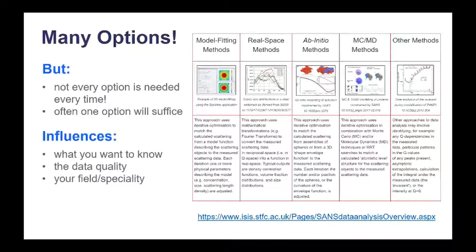As we saw from Otto's talk, some of these methods are model-free, others require starting structures or some intuition about the shape of what is responsible for the scattering. Model fitting, that is the iterative comparison of an analytical calculation to the reduced data by means of the optimized variation of the model descriptors, is far and away the most common, most used method of SAS data analysis, particularly in soft matter science.